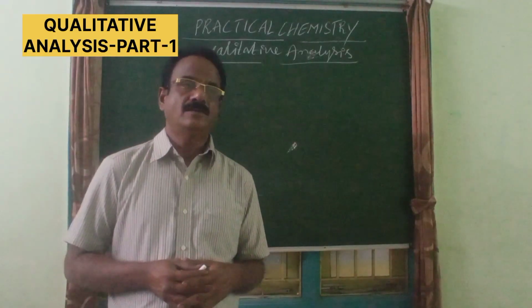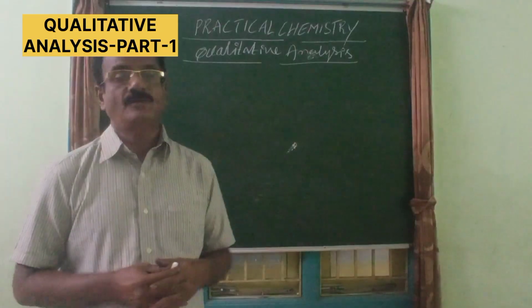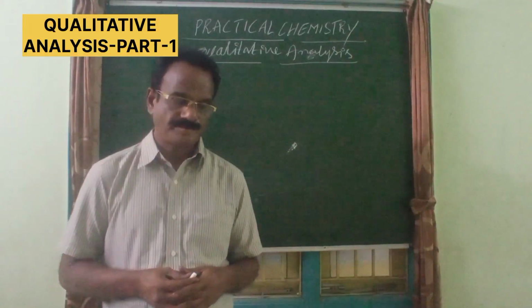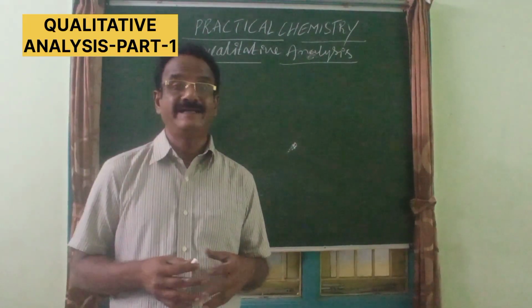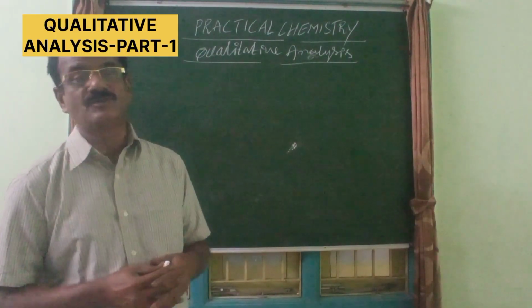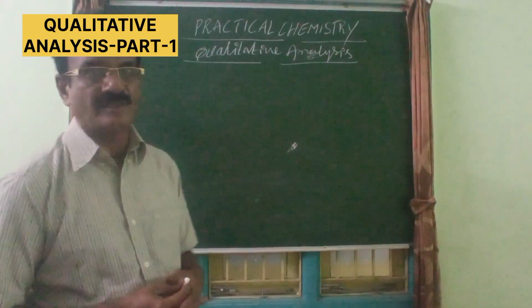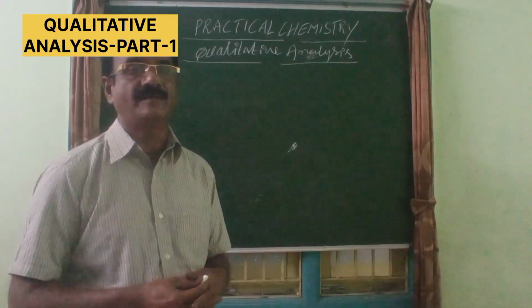So let us see about inorganic qualitative analysis in this video. Here I would like to explain how an inorganic salt can be analyzed by a student in the laboratory. So let us see about the analysis of inorganic salt by means of a systematic procedure.